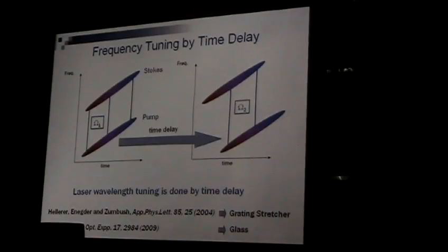So compared to the single frequency, previous version, you don't have to tweak your cavity or change the temperature of your crystal. All you have to do is delay, which can be done very fast. This is actually not my idea. It was first demonstrated like 5 years ago, and people kind of forgot it. What they didn't realize was they just looked at a very small bandwidth, something like 100 femtoseconds. They worked in a 100 to 200 wave number region, and they realized they have to stretch really long. But what we found is, if you have broadband, the situation is much better.